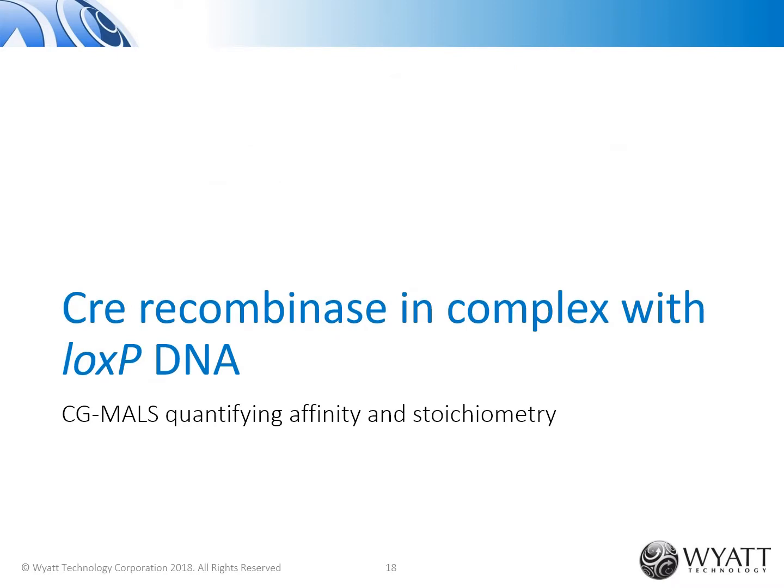In this case study, I'm going to present a different application of MALS called CG-MALS, or composition gradient multi-angle light scattering. This lets us measure the affinity and the stoichiometry of complexes forming in solution. In this case, we're looking at a Cre recombinase in complex with a loxP DNA recognition site.